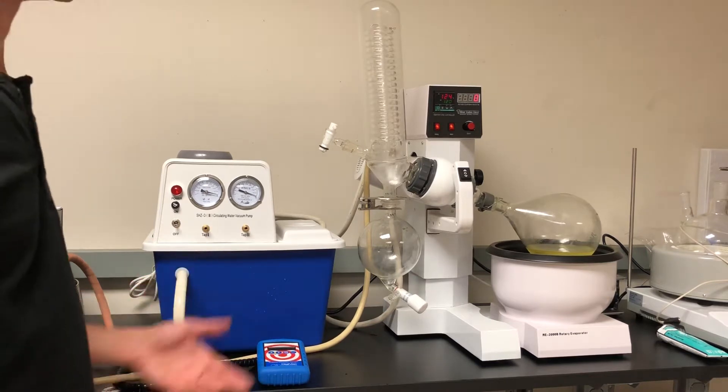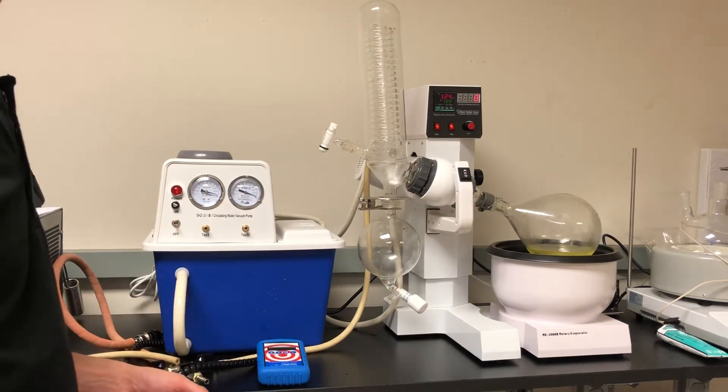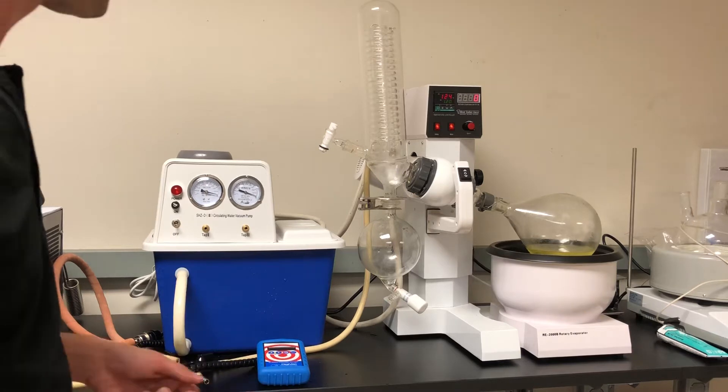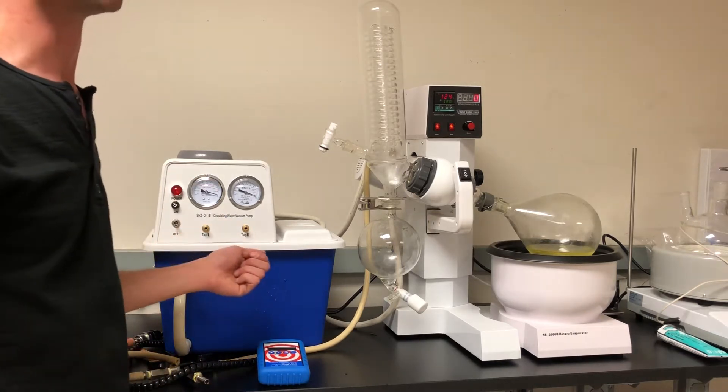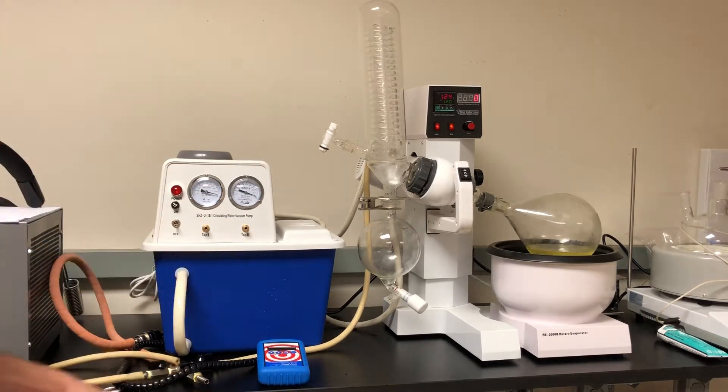And for roto evaporation, we don't want that. We want to have a nice high micron, but we want to have a good quality vacuum. So this kind of kills two birds with one stone. You got your vacuum pump and your water circulator.